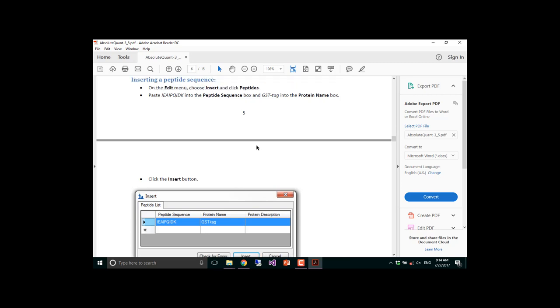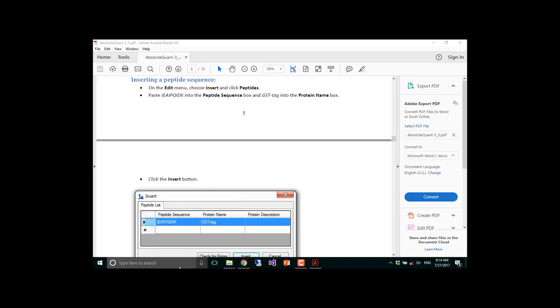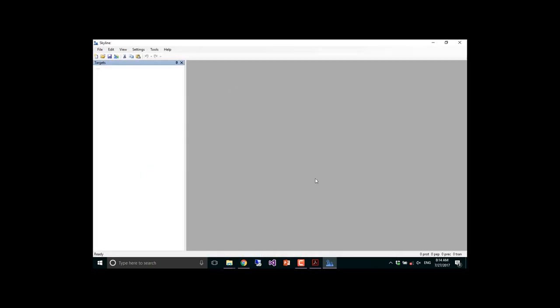There it is. Okay, so let's go ahead and open Skyline. And we're just going to create a blank document. Okay, so just Skyline.